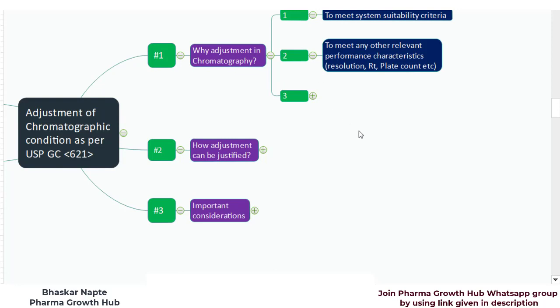The second reason could be to meet other relevant performance characteristics like resolution, retention time, and plate counts. Since the systems you are using may differ from those in which the method was validated, you may observe different resolution because your column manufacturer is different or your tubing of the HPLC system is different. Because of that, you may fail to get the expected resolution, relative retention time, number of plate counts, or tailing factor. This becomes the second reason why you may need to consider an adjustment to chromatographic conditions.